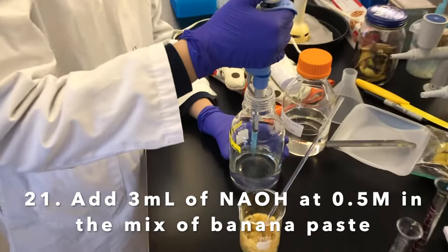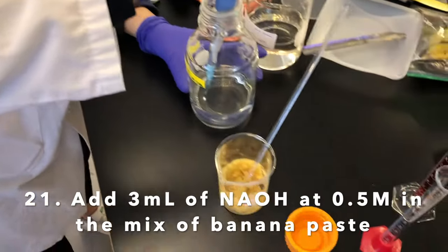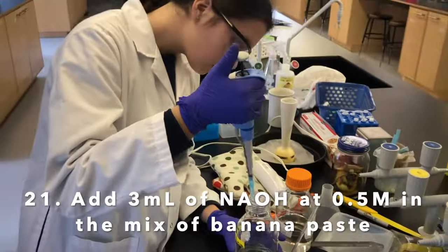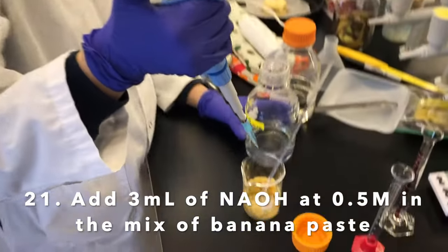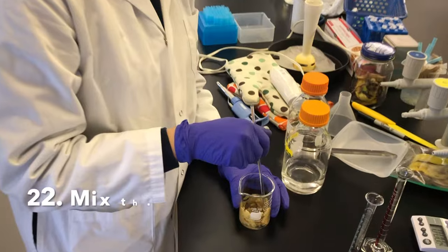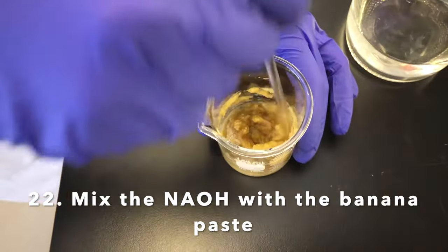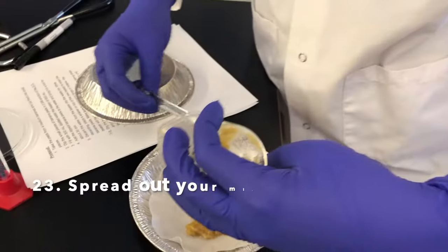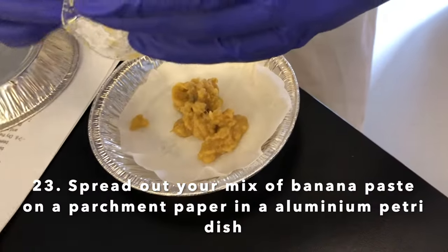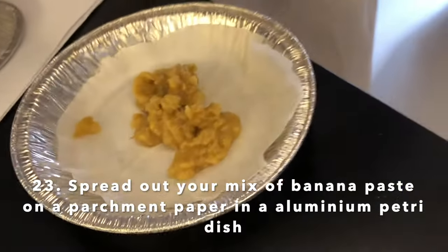Emily is going to use the micropipette and add 3 times 1 ml of NaOH into the banana paste solution. Emily is mixing for the last time the banana paste with the NaOH. Marion is then putting the banana paste into a petri dish to go into the oven.